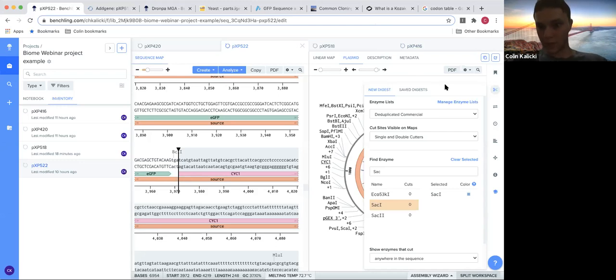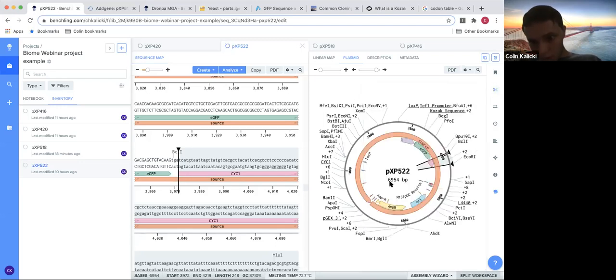But yeah, how expensive is getting the plasmid made for you? It depends on the company. 10 to 20 cents per base pair, I think. Or base, maybe. So you're looking at this one. I can't do math, but maybe you can. This is almost 7,000 base pairs long, so about $700-ish. Why don't you delete all the blank space? You could delete all the blank space here and save time and save money. I'm leaving it open right now because I would add other things into it.